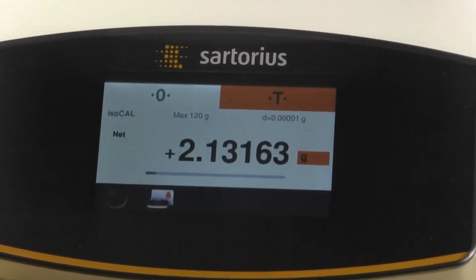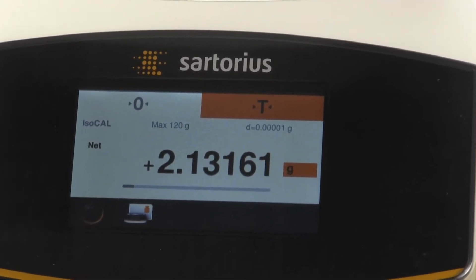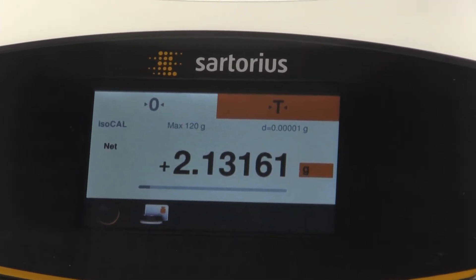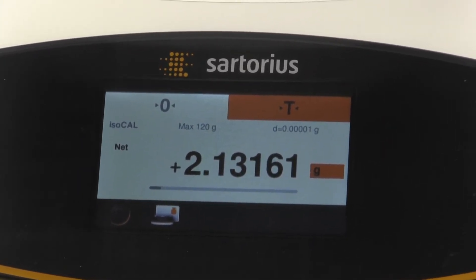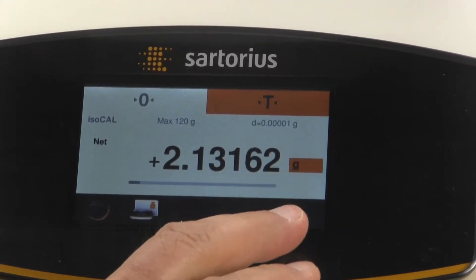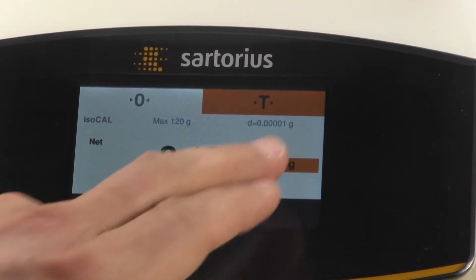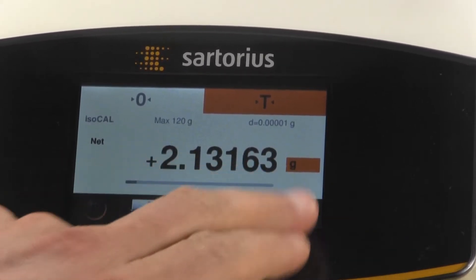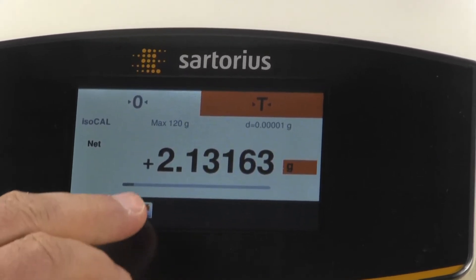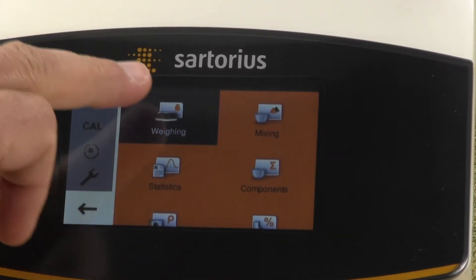Now I want to show you some more features. This is a five decimal place balance — the most sensitive in the Sartorius Secura Quintix series. We can actually go into the menu and drop the last decimal place. Right now we have five digits after the decimal place. We can go into the menu by selecting Weighing.